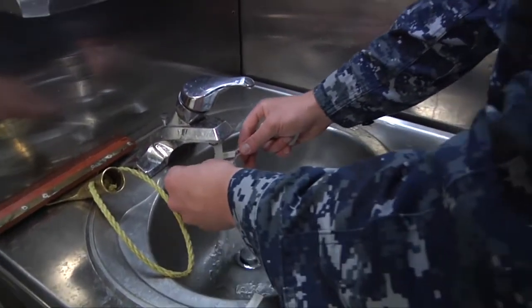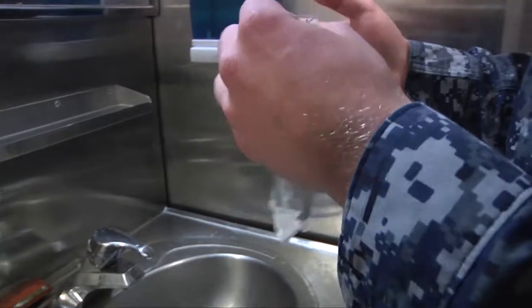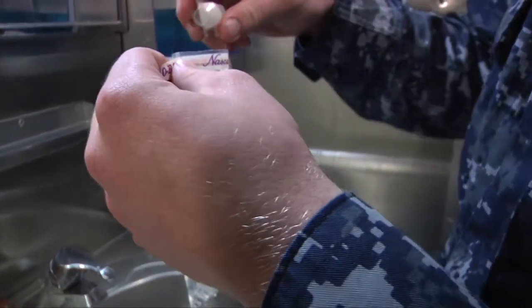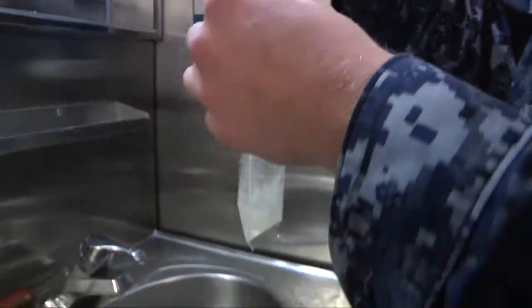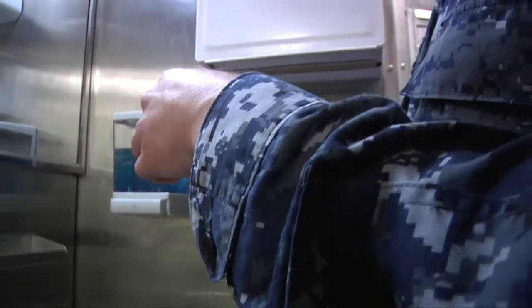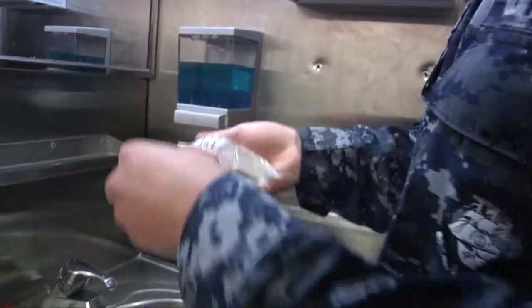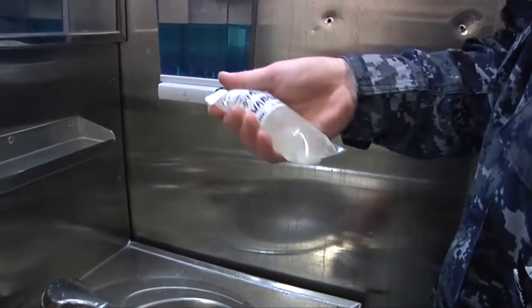Just fill it up to the fill line right here. Then you just pop the top on this. Pour a little in there. Tighten the bag — go ahead, three turns. Fold these forward. Then we mix the ColiAert in there pretty good.